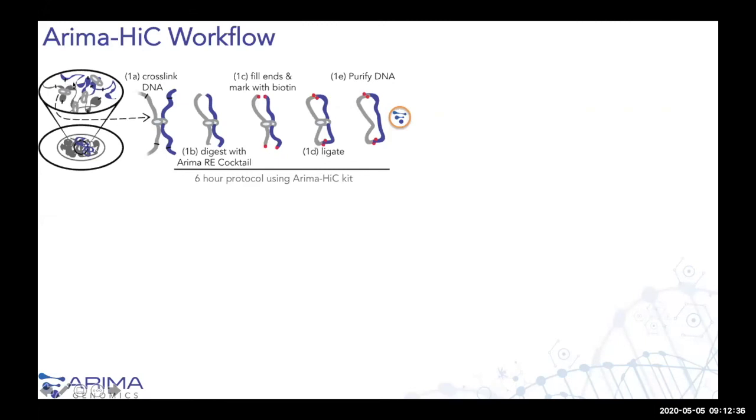So what is depicted here is essentially 2 pieces of DNA, when you're looking down on a cell, that are not close along the linear genome, but they are held together in 3-dimensional space by this protein. Once you have your digestion here, those ends get labeled with a biotinylated nucleotide and then ligated back together.